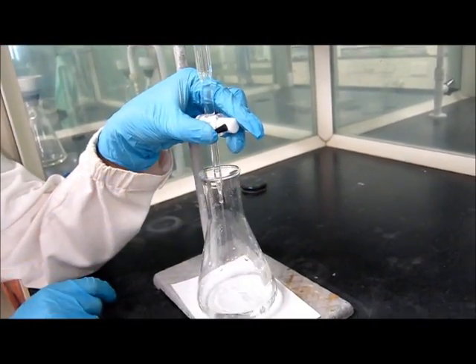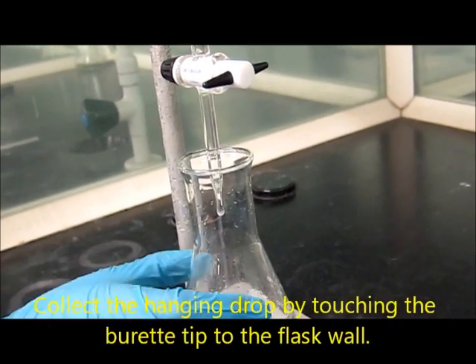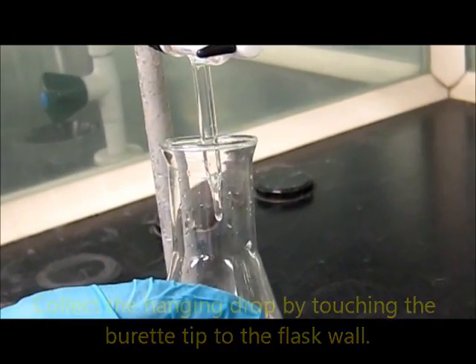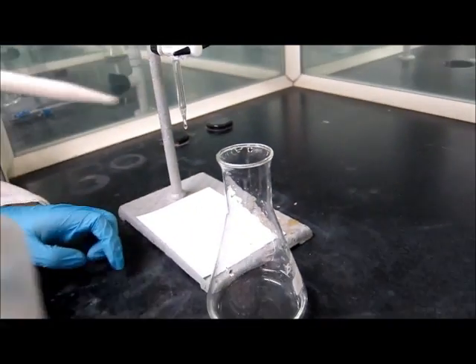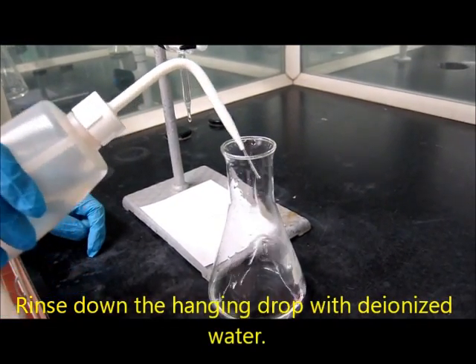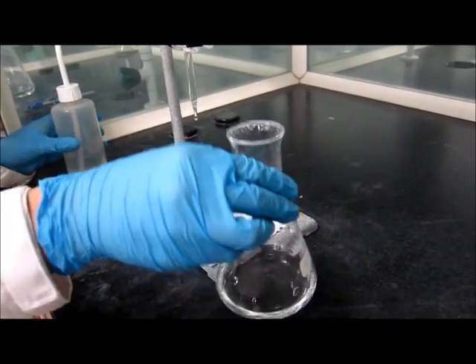Now, collect the hang drop by touching the burette tip to the flask wall. It's in! Rinse down the hang drop with deionized water. Flush it down and swirl the conical flask as you do it.